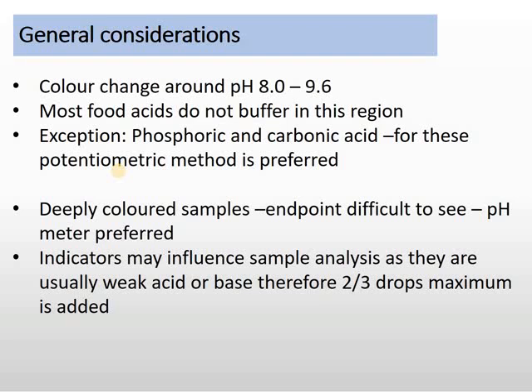They're very dark, especially your freshly squeezed samples. The endpoint is difficult to see, because you will be adding your phenolphthalein and your sodium hydroxide, but because the sample is dark, you can't see the endpoint. Remember, when you are titrating clear solutions, it is that faint pink color that persists for more than 3 seconds, so maybe between 3 seconds and a minute. If it's dark, how are you going to see that faint pink color? So that's why the pH meter is much more preferred, so that you don't get any errors.